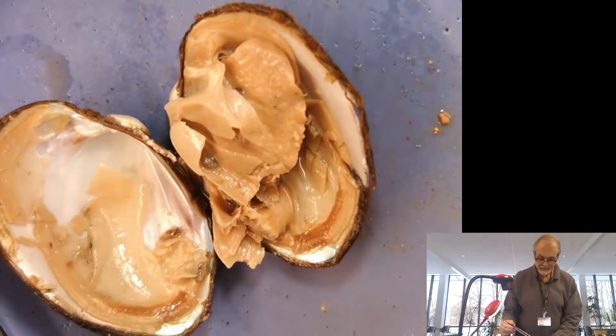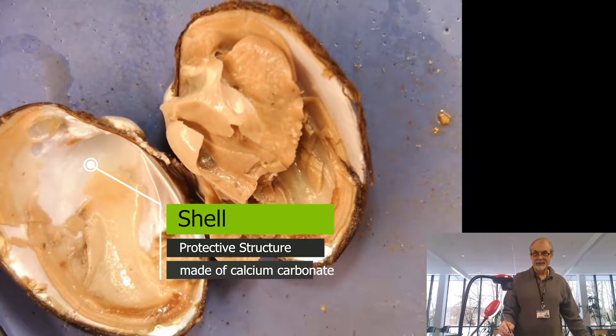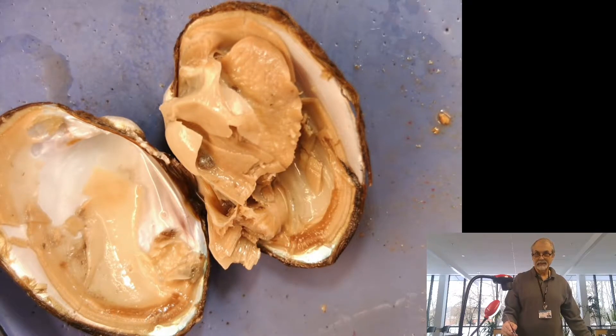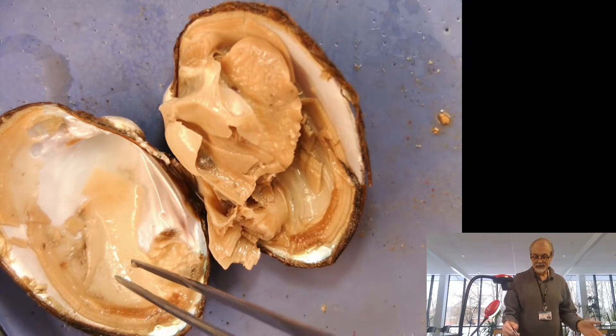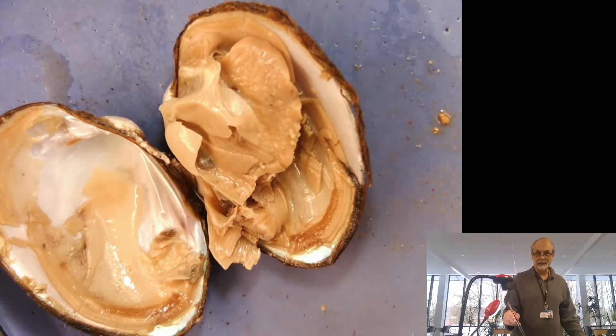It has a calcium carbonate shell. Sometimes you hear about people — like oysters will produce pearls. And like an oyster, if it gets an irritant like sand or some material inside of it, that will start to grind on it, and it finds that uncomfortable. It'll coat it with this calcium carbonate that you see that forms the shell, until you produce a pearl.